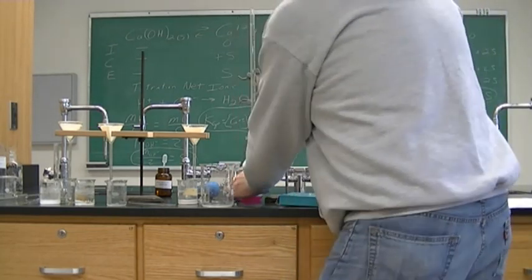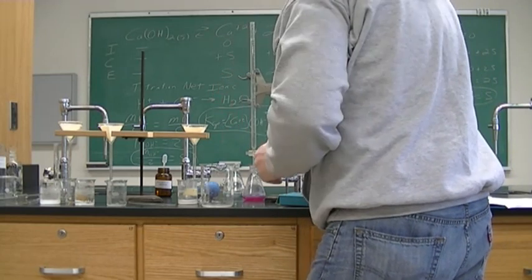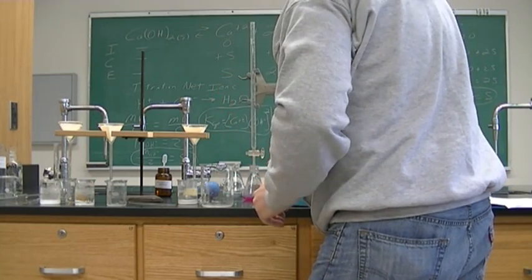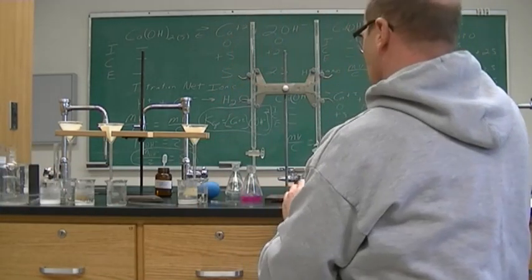And now we're going to add our HCl until it is colorless.